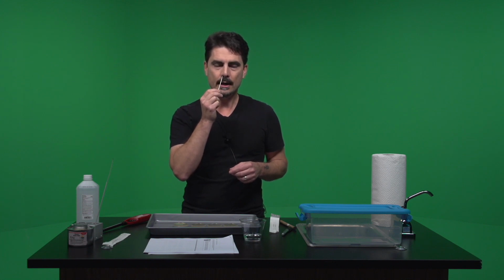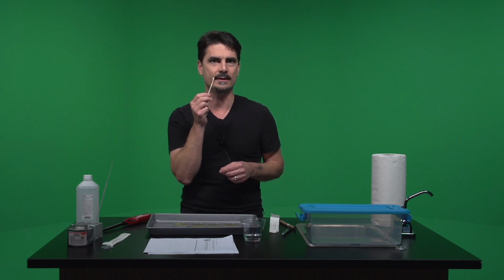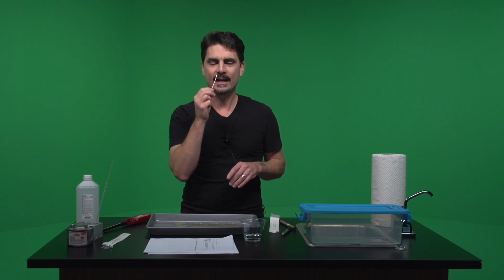And there's a good chance that you will get a high number of microbes. And so don't just do it a little bit. The point is you want to see the microbes. Don't put it in there for a few seconds and be like, oh, well, I don't want to seem like I'm dirty. Everybody's got microbes in their nose, and the point of this class is for you to understand that and to, well, have some joyous experiences with your bacteria.